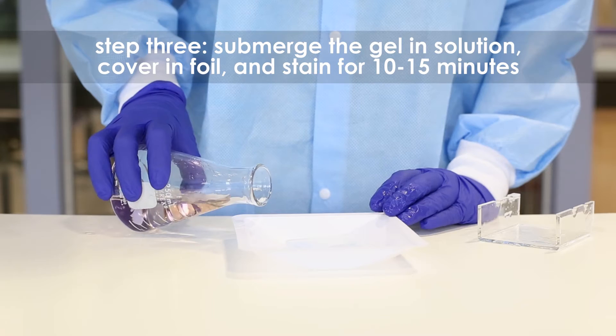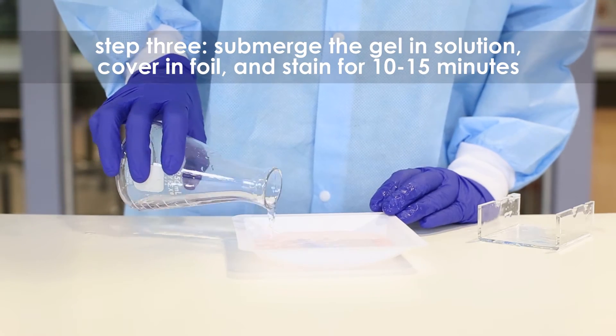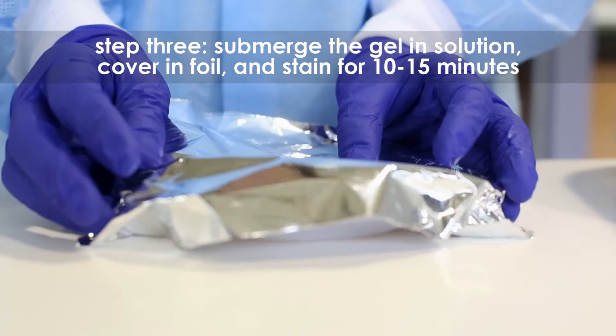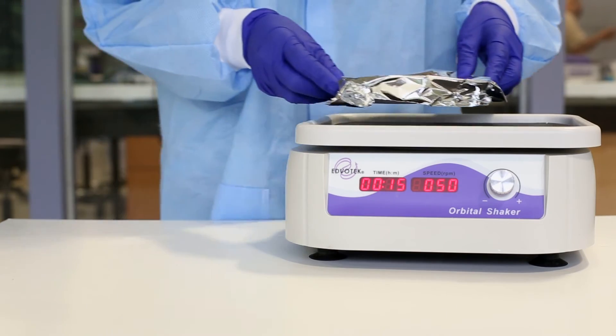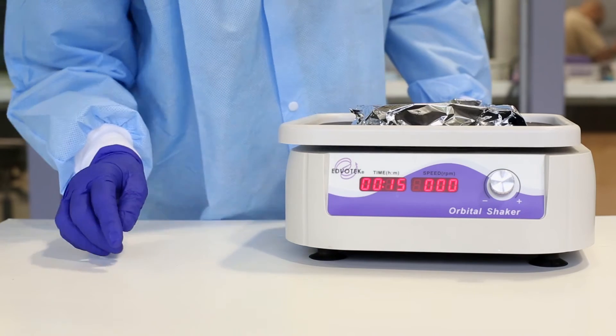Step 3. Submerge the gel in the diluted CyberSafe Stain solution. Cover the tray with foil to protect the gel from light. Stain the gel for 10 to 15 minutes. For best results, use an orbital shaker to gently agitate the gel while staining.